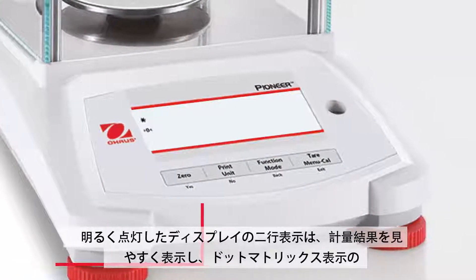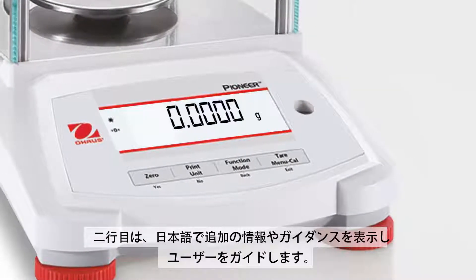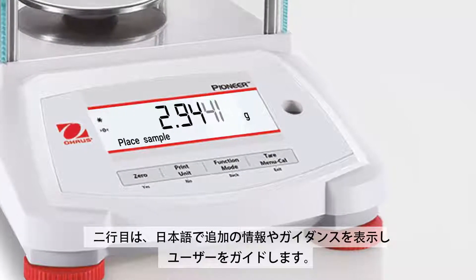A brightly lit dual line display shows the weight in an easy to read manner, while a dot matrix second line provides additional information or guidance prompts to the user.